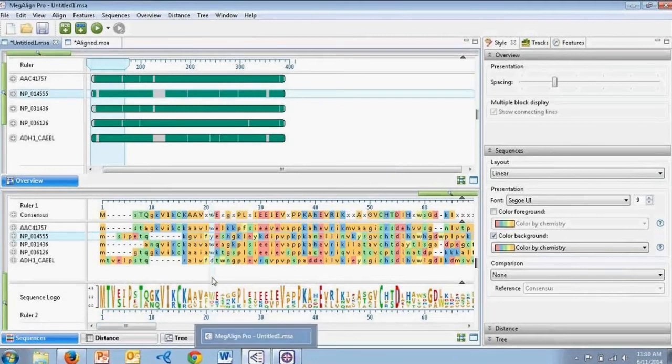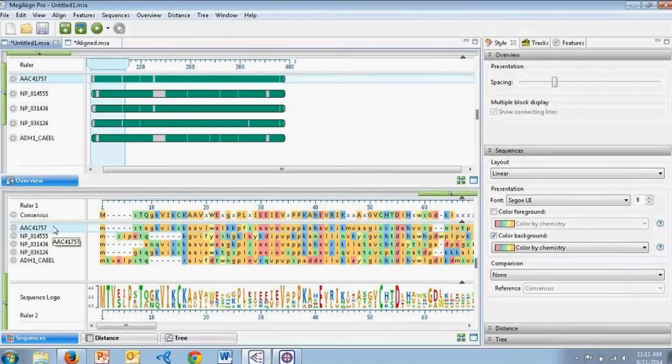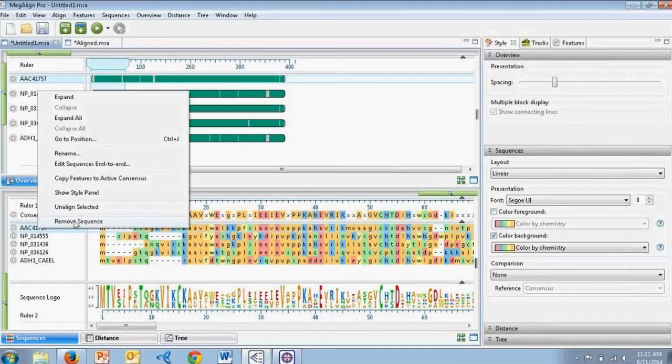At the top of the sequences view, we can see the consensus sequence and consensus ruler up at the top. And then in the sequences area here on the side, we can see the names and codes for each of our sequences. Now the names of each of these sequences that we can see here originated from the locus names which were embedded in our input sequence files. And so we want to be able to change these names so we can more easily perform analysis on our alignment.